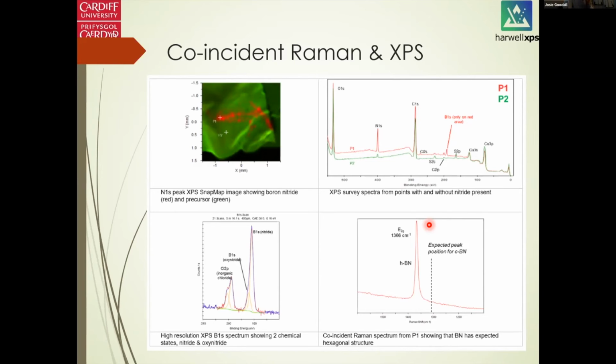For example, if you work with very thin layer films, you want to make sure that the films don't have defects, and Raman is here to help. Also, if you work with lithium-ion batteries, XPS can give us the information that the surface elements change after certain numbers of cycles.